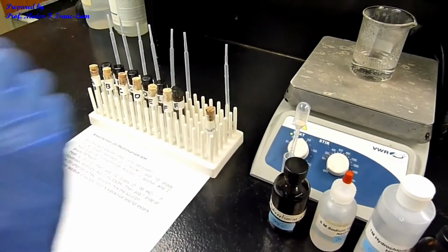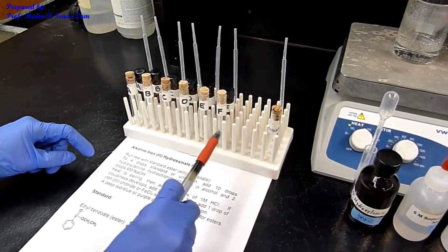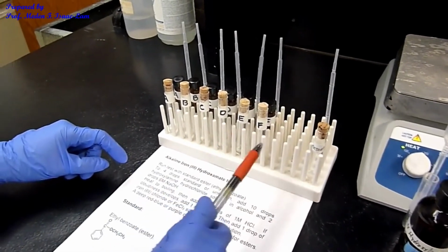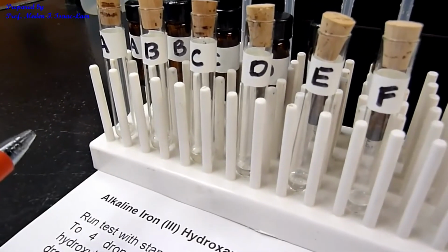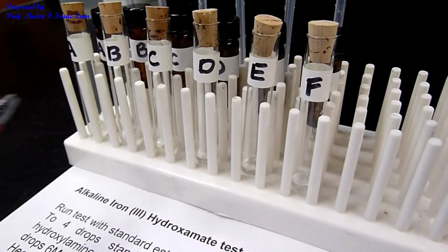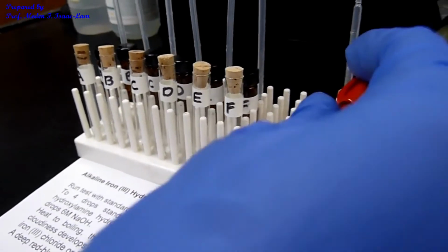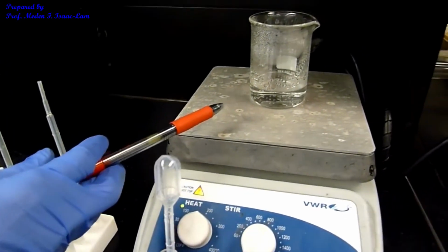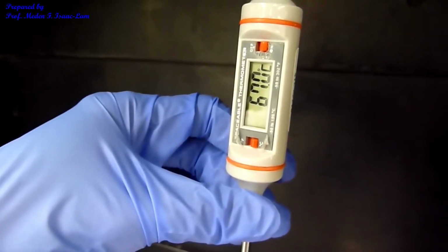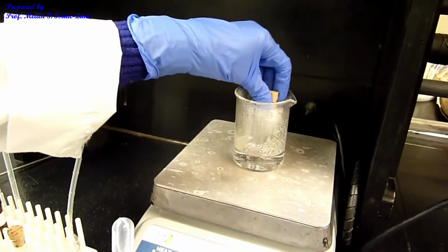So I shake it, and I already added in here 4 drops of each of the unknowns labeled as A, B, C, D, E, F. I already added 10 drops of the hydroxylamine hydrochloride solution in alcohol, and then also 2 drops of 6 molar sodium hydroxide. So I already have a water bath heating in here. Temperature is close to 70. So I'm now going to immerse the tubes and then heat it for about 5 minutes.